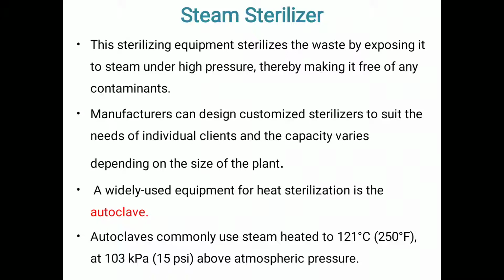The laboratory apparatus used to generate steam under pressure is called an autoclave. Saturated steam is a more efficient sterilizing agent than hot air because it provides greater killing action of moist heat. It is quicker in heating up the exposed articles and it can penetrate porous materials easily, and many more.